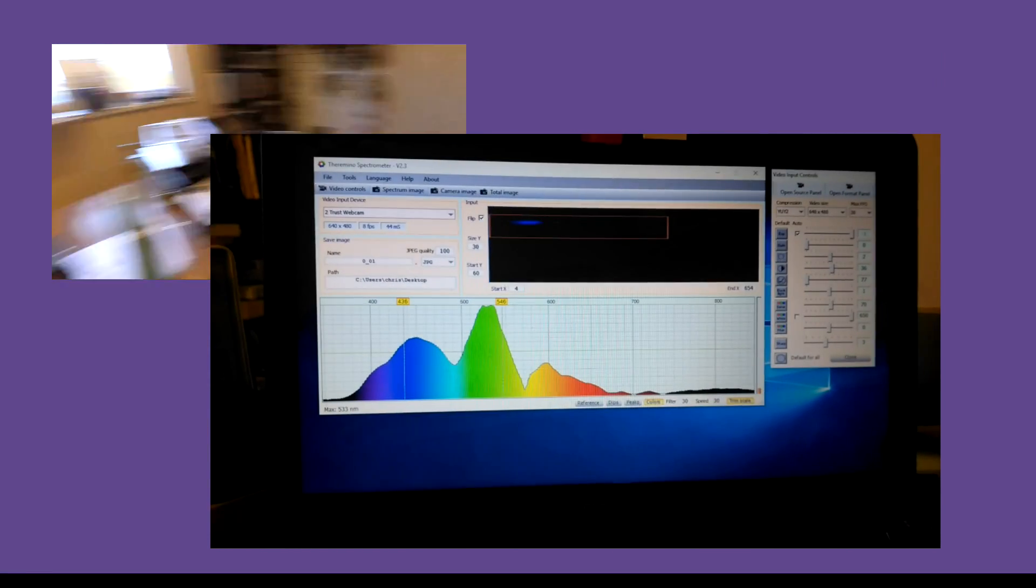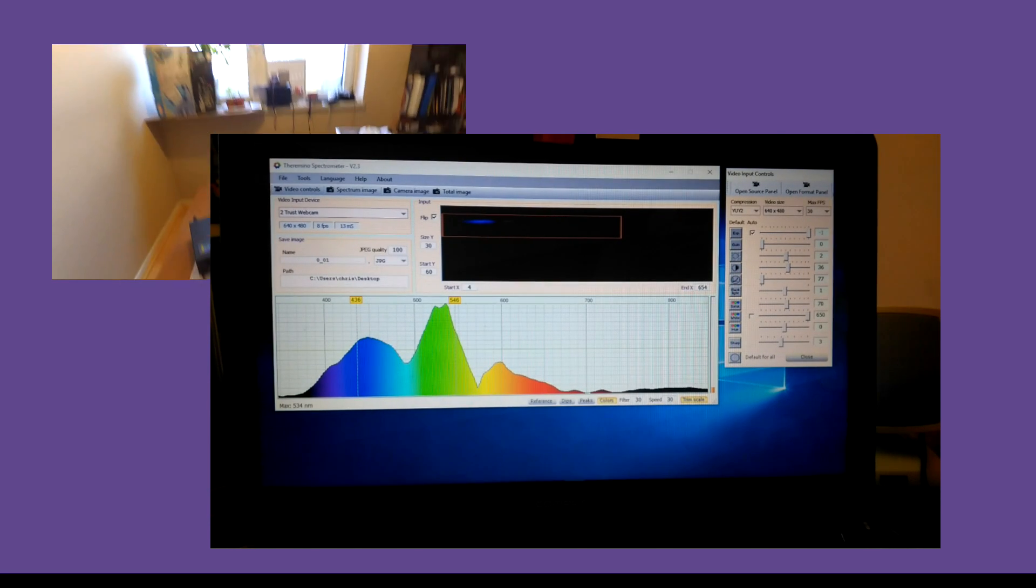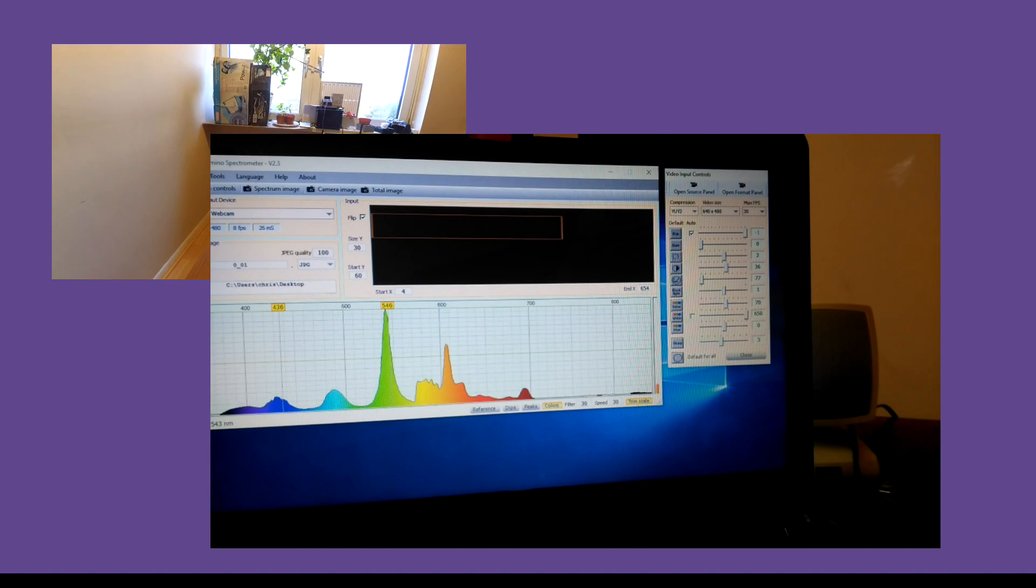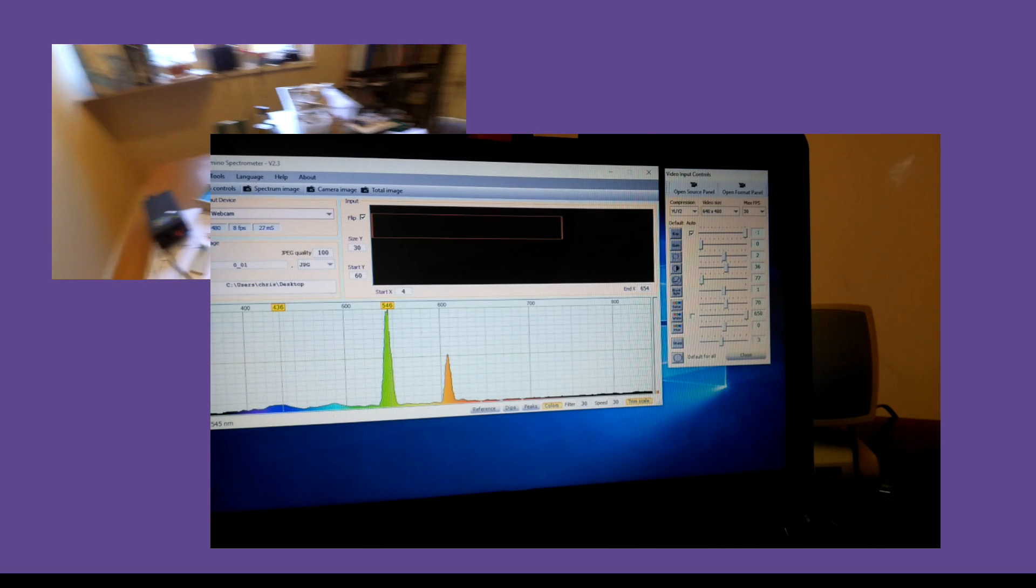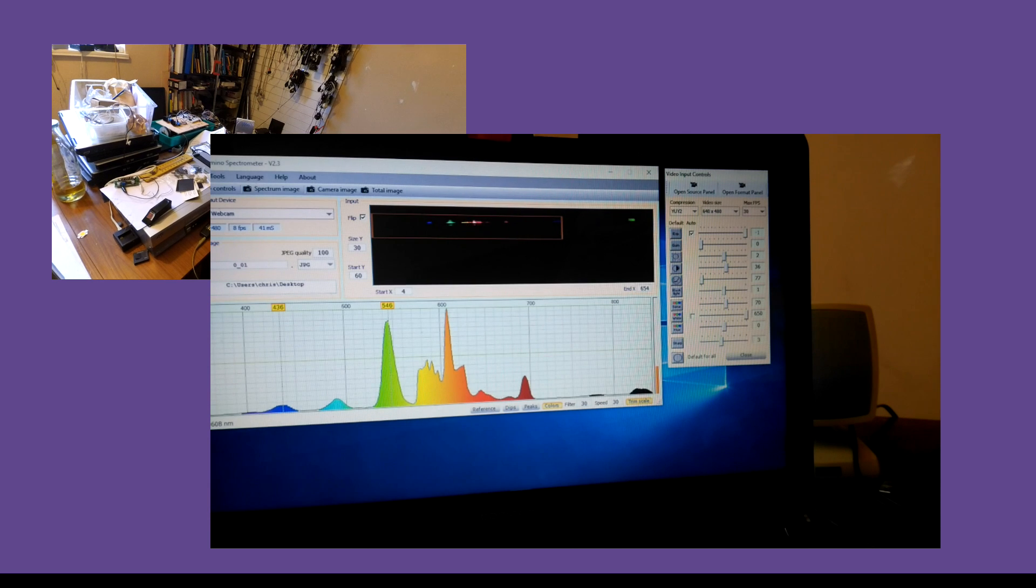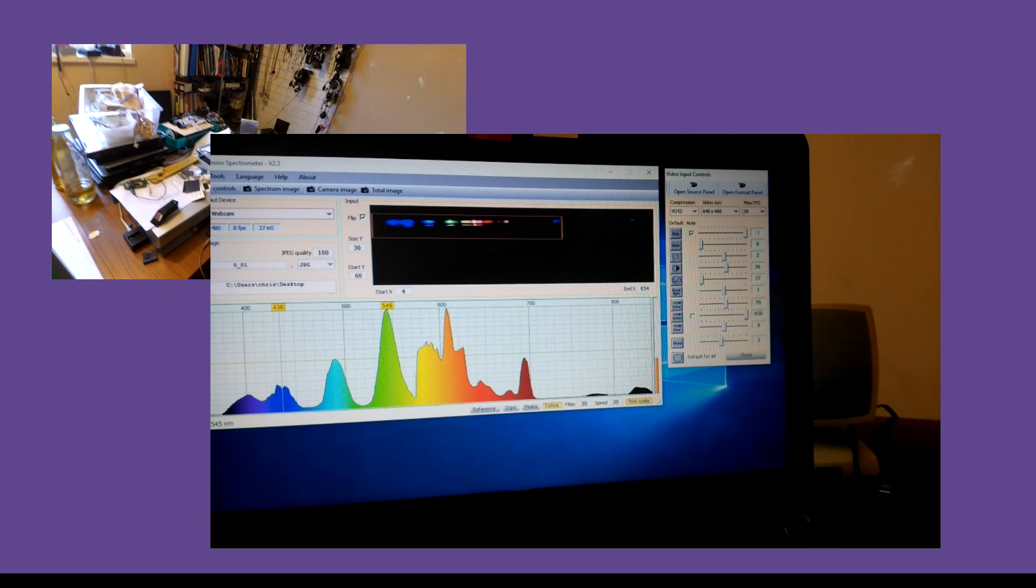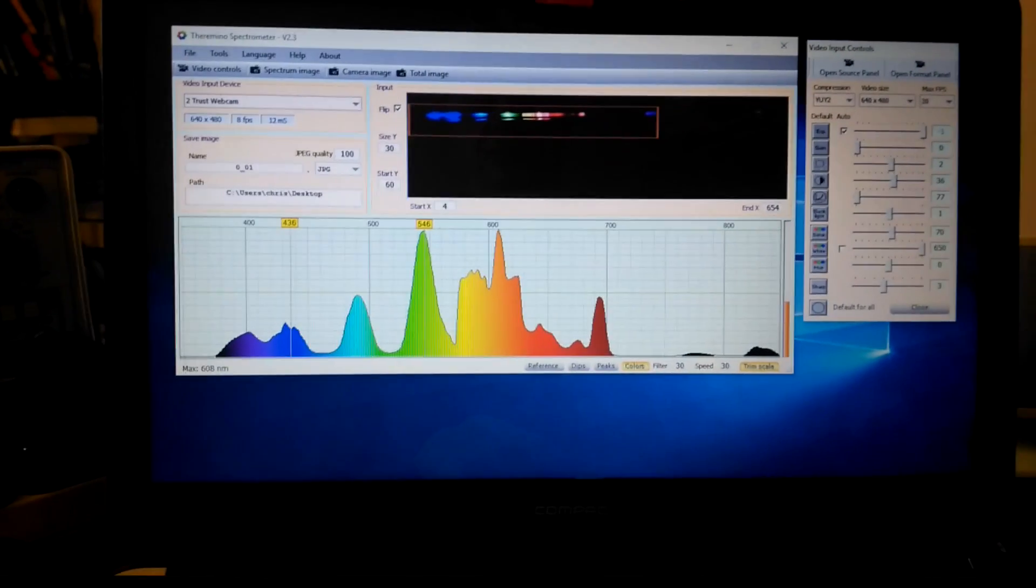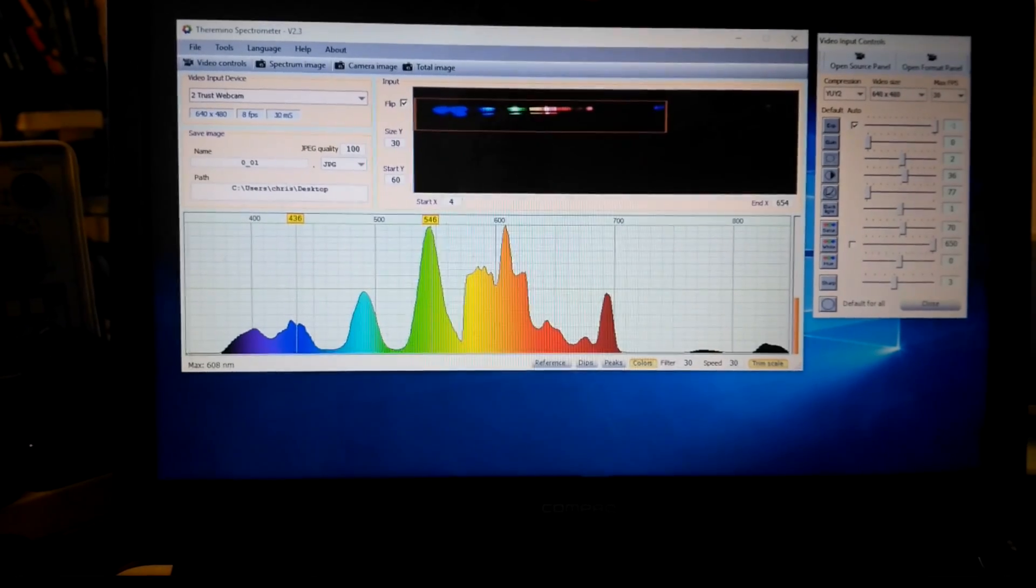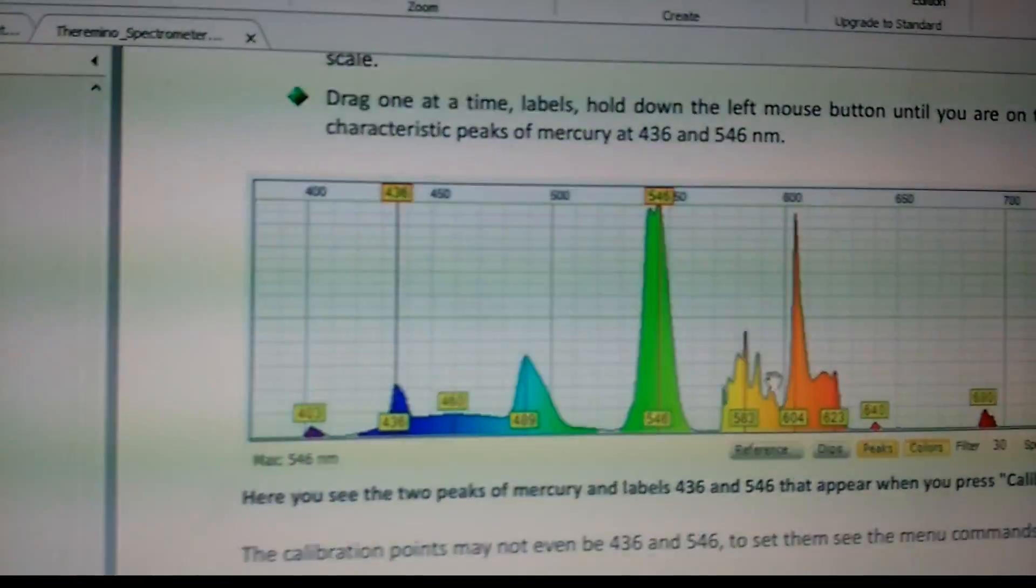I'm going to point the spectrometer up at the fluorescent light if I can get it up there. Right. So let's look at the spectrum we've got on the screen and compare it with one of these reference spectrums. And I think you can see that it's not this one, it's this one.